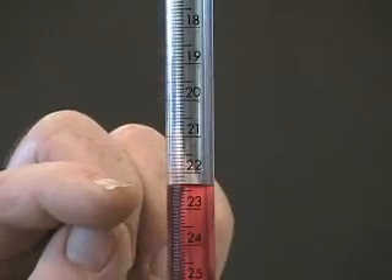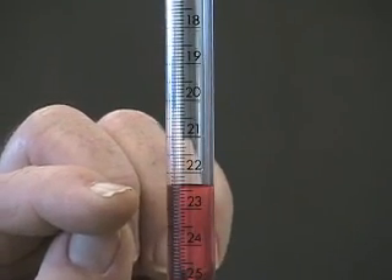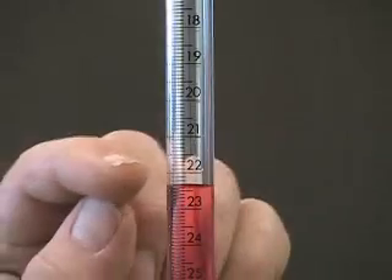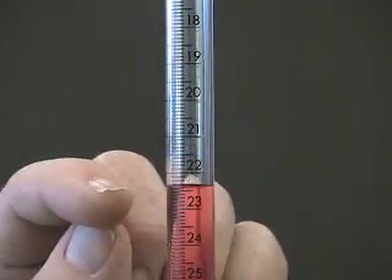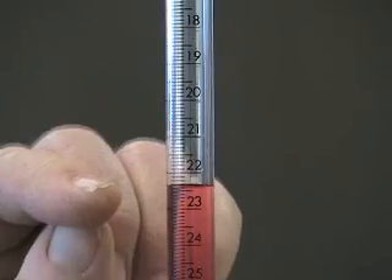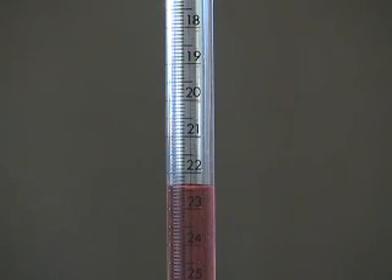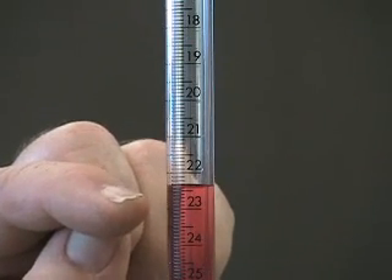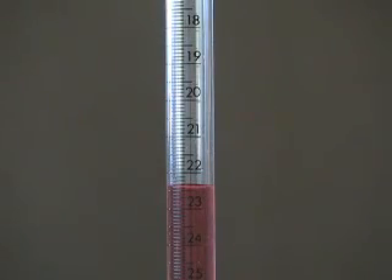If I look carefully at the bottom of this meniscus, I see that the bottom lines up very closely to 22.4 milliliters. Since it's not obviously above or below 22.4 milliliters — that is 4 tenths of the way between 22 and 23 — I would record the volume as 22.40 milliliters. The zero tells us that I did not think it was a fraction of a division above or below 22.4.